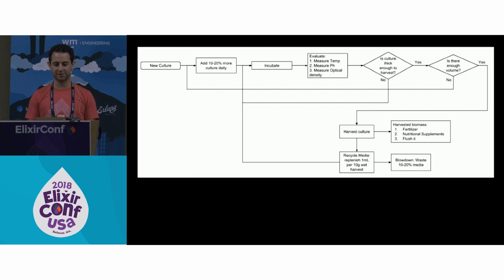So while I was researching this, there was all kinds of great documentation on how to use really expensive, high-end equipment to do this, and I just don't have that kind of money. I found a company called Algae Research Supply that supplied some documentation on a much simpler way to grow algae. They sent me a kit halfway around the world. They were really cool on getting me connected with documentation and how to grow the algae and manage the state of the system.